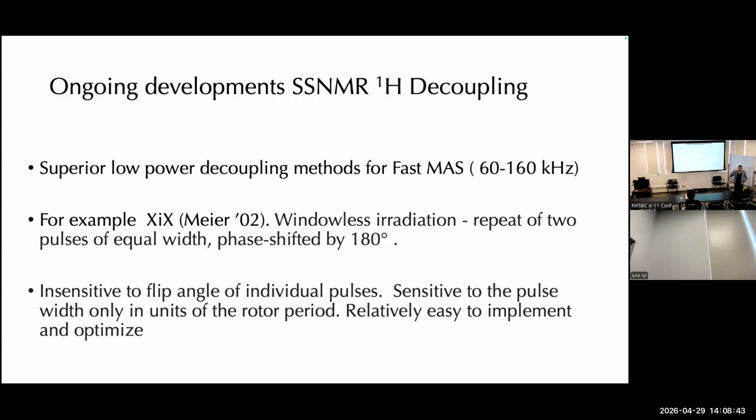If you think about the RF string, in the time it would have taken you to do a full cycle of 2 pi, you're going to have a whole bunch of little pieces in there, and hope that that somehow gives you the bandwidth and the performance that you need without that much power.